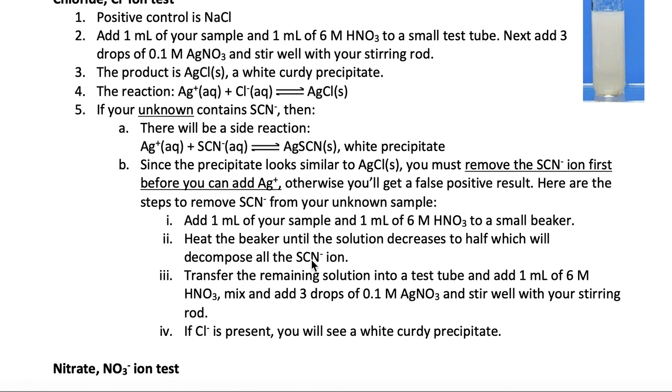Once that happens, you can then transfer this solution back into a test tube and then add nitric acid with three drops of silver nitrate and stir and check if you see the precipitate. If that white curdy precipitate forms, then chloride is present in your sample.